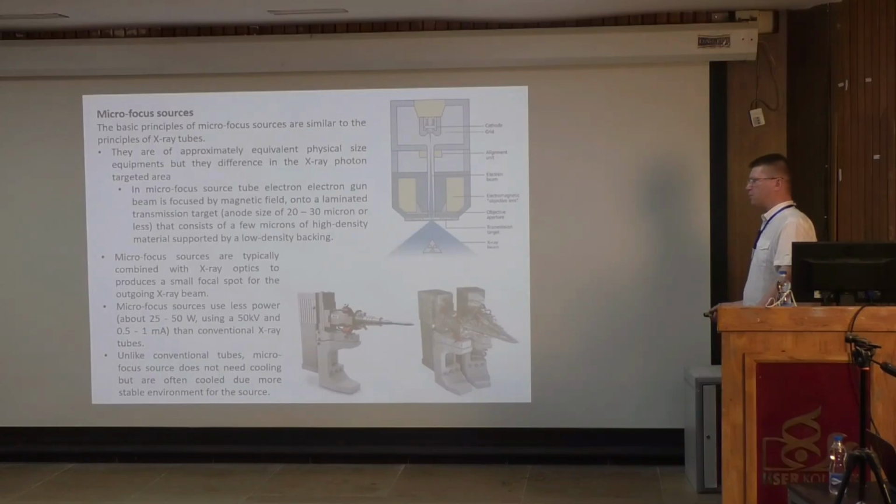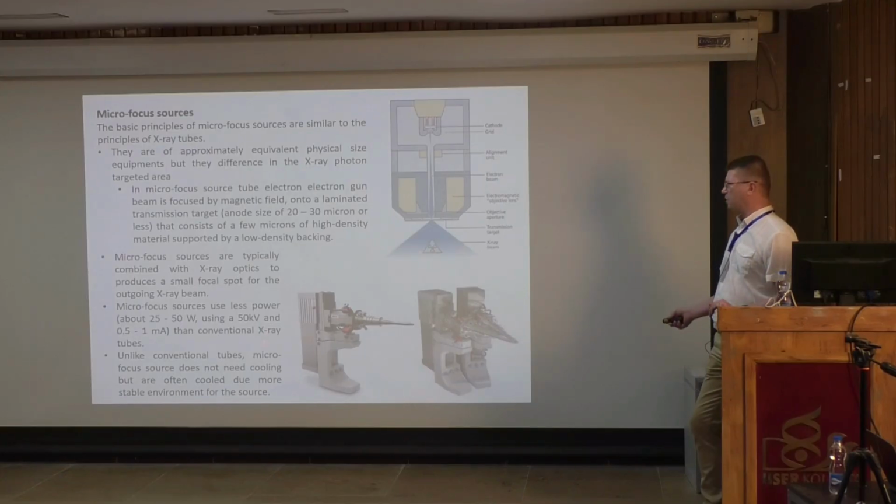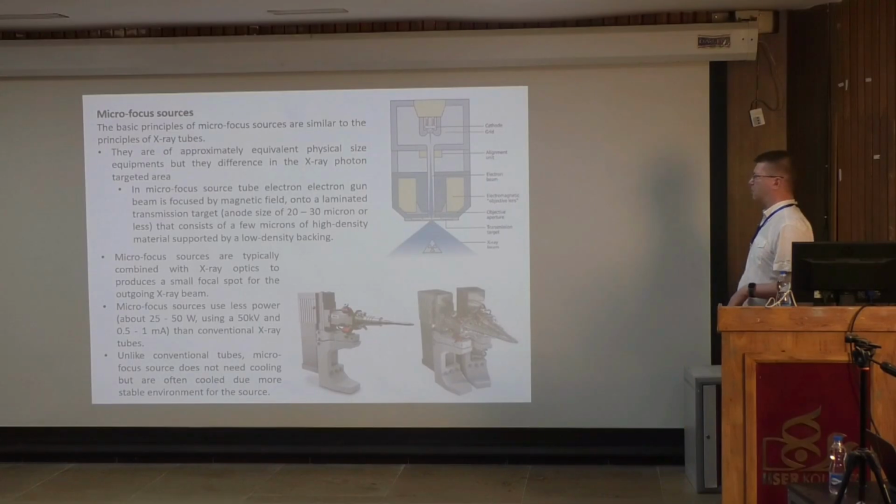These are also rather expensive. This is about 10,000 euros. But they also last some 4 to 5 years maybe at the current stage. So they are a little bit more expensive than the stationary, the classical ones, but they are also 20 times more powerful. So you save energy and time when using these kinds of things. And in our university, in our department, we have both. We have this and the rotating anode system. But that is just the technological side of how you do this.